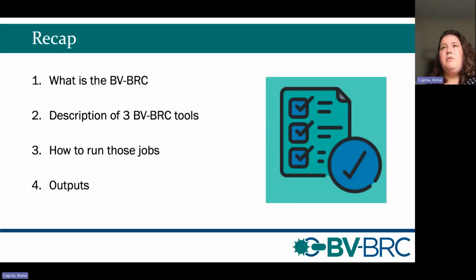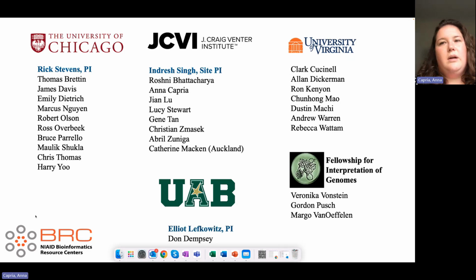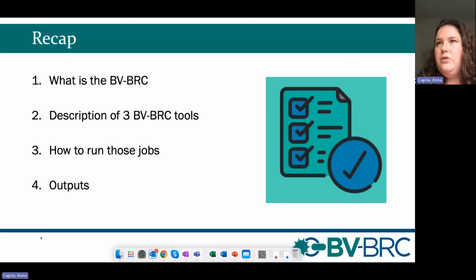So just to recap everything that we talked about: what is the BV-BRC, gave you a description of 3 BV-BRC tools, showed you how to run jobs, and then we very quickly went through the output of those jobs. Again, there's way more specific information about all of this in the tutorials. I just wanted to show you all a high-level explanation. I also mentioned at the beginning that the BV-BRC is a multi-site project, so we have people at the University of Chicago, JCVI, University of Virginia, UAB, and the Fellowship for Interpretation of Genomes, and we are a NIAID-funded bioinformatic resource.